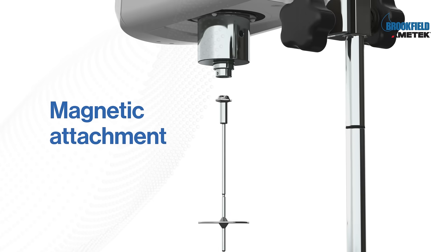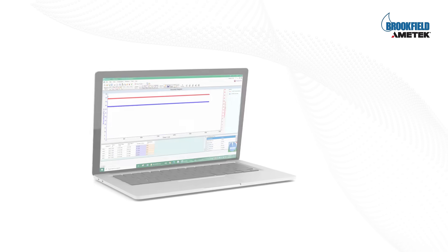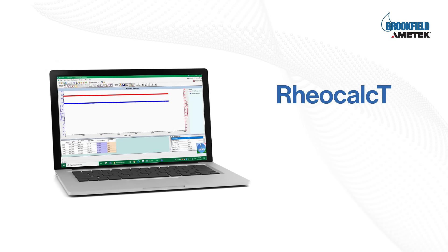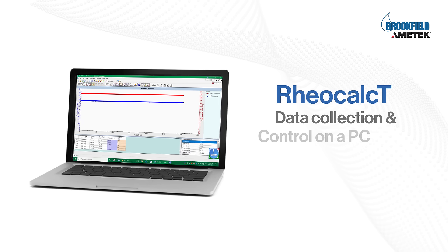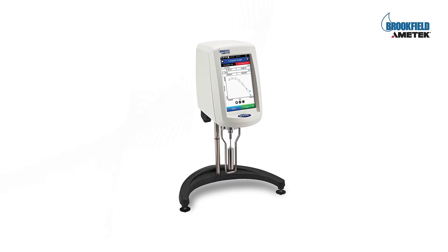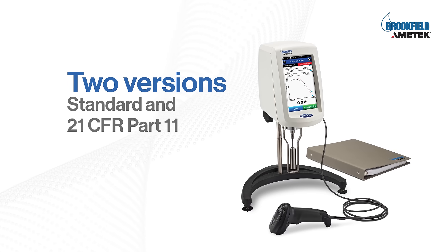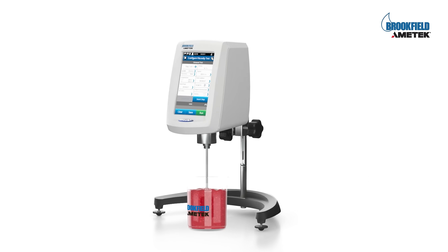Attach your spindle quickly and easily with the optional magnetic coupling system. With the help of RheoCalc T software, the DV Next rheometer can connect to a computer and perform advanced data collection and analysis. It's available in a standard version and a 21 CFR Part 11 compliant version as well.